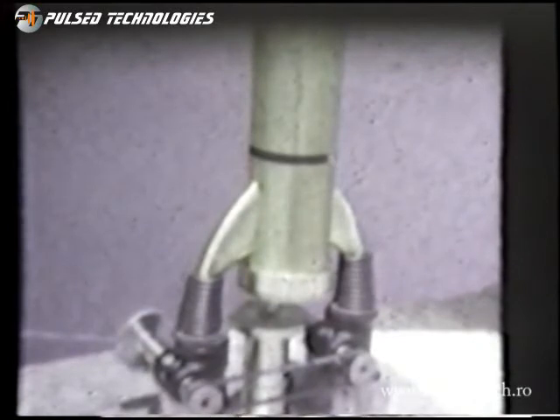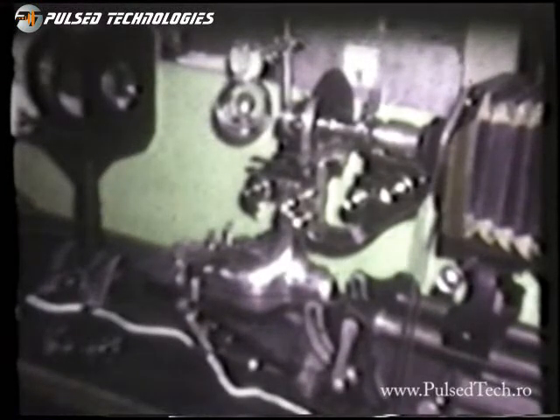This is a rear view of the same instrument showing the belt that's connecting the two jack screws. Now, this is a test setup on the Leitz optical bench showing the optical system, which can be projected to test out the various optical components.